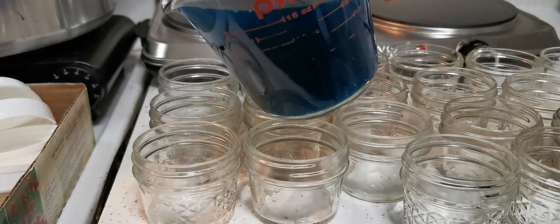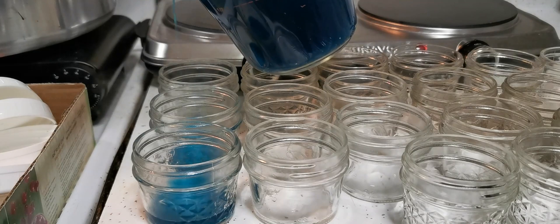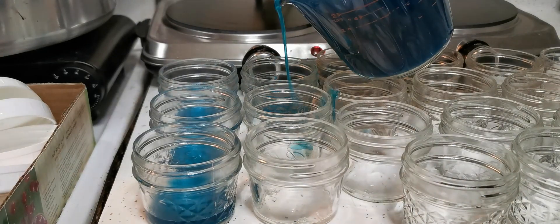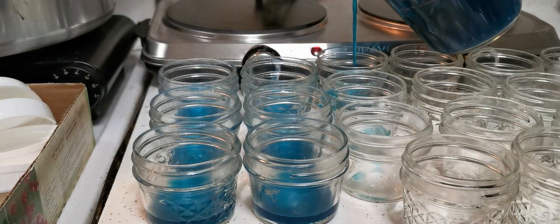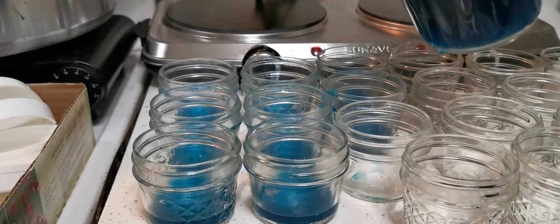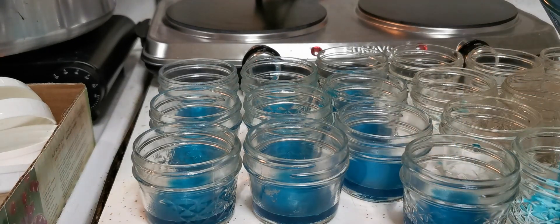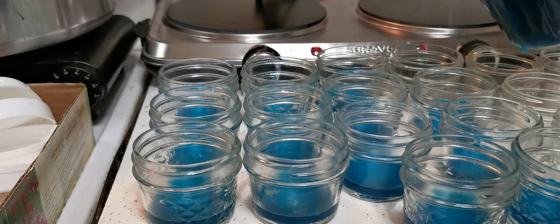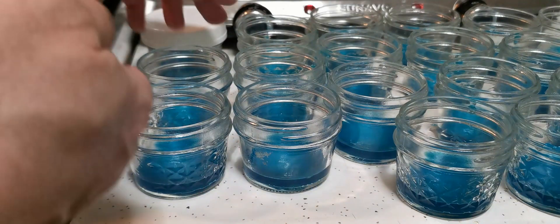We're going to pour our cups about a quarter of an inch deep. Once we've got our cups poured, we're going to go ahead and lid them and screw the lids on about as tight as they'll go.